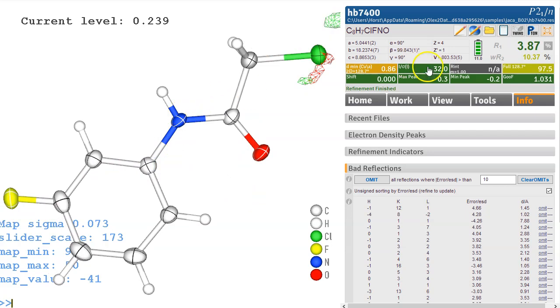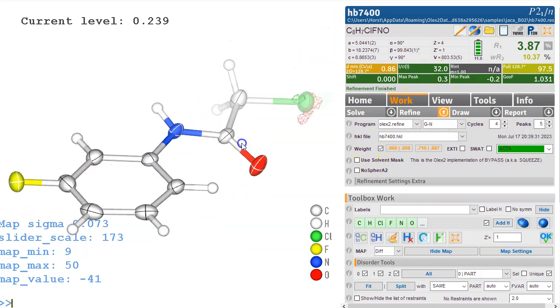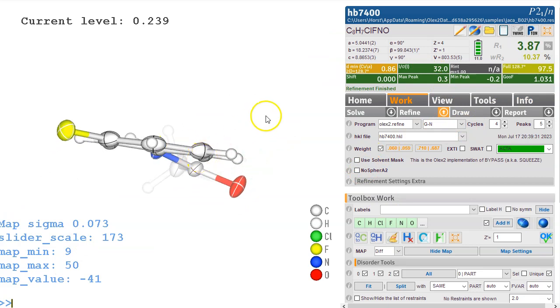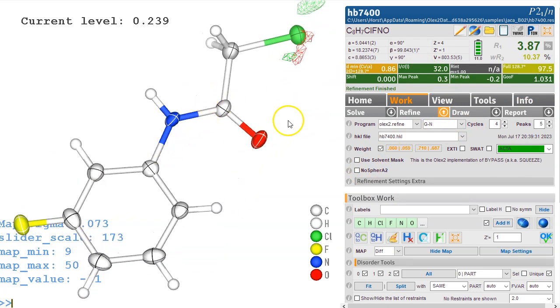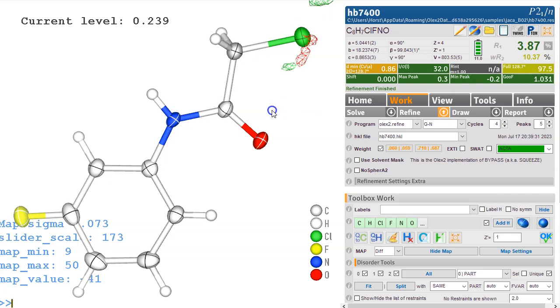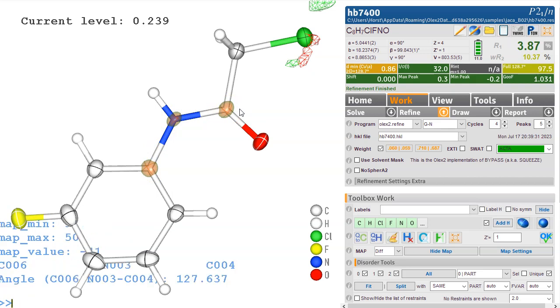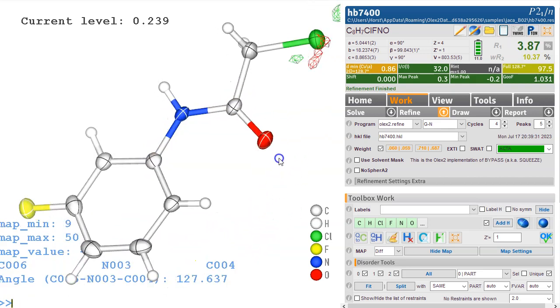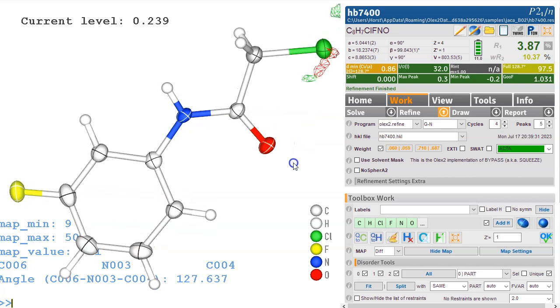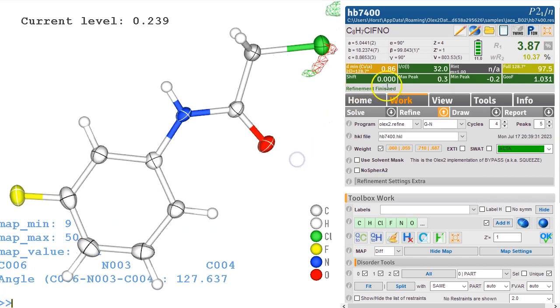Right, so let's try and do a non-spherical form factor refinement because if you look at this, this might be interesting with a slight angle in here so this is not really all sp2, it's a bit funny here. So this angle, if you select those ones and type cell, so that's an angle of 127 degrees, that's really quite a lot open, so it's an interesting one to maybe look at in more detail.